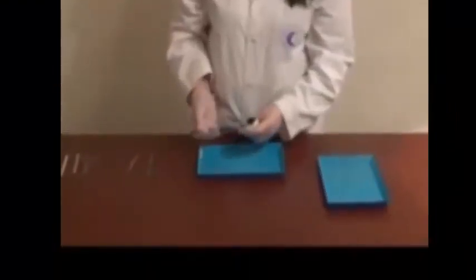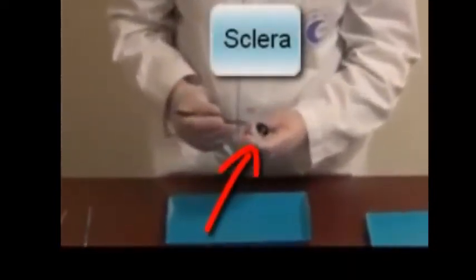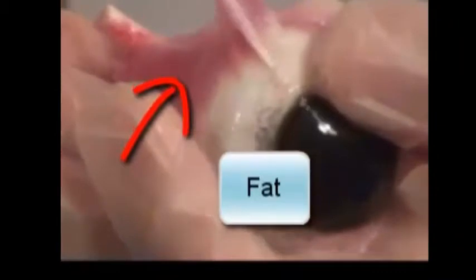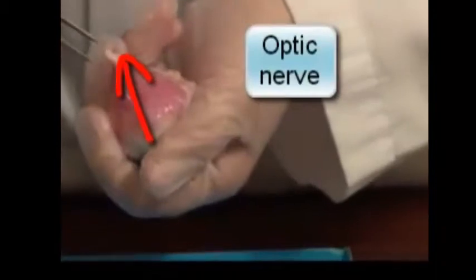Before we dissect, let's observe the outer areas of the cow's eye. The sclera is the thick, tough, white outer layer that covers all around the eyeball. In the middle is the cornea — it is clear, thick, and has many layers that allow light to pass through. Notice there is fat around the eye; it cushions the eye as it sits. There is also a thin, moist membrane covering the front of the sclera called the conjunctiva. At the back of the eye is the optic nerve, which connects the eyes to the brain and sends signals of images so the brain can interpret them.